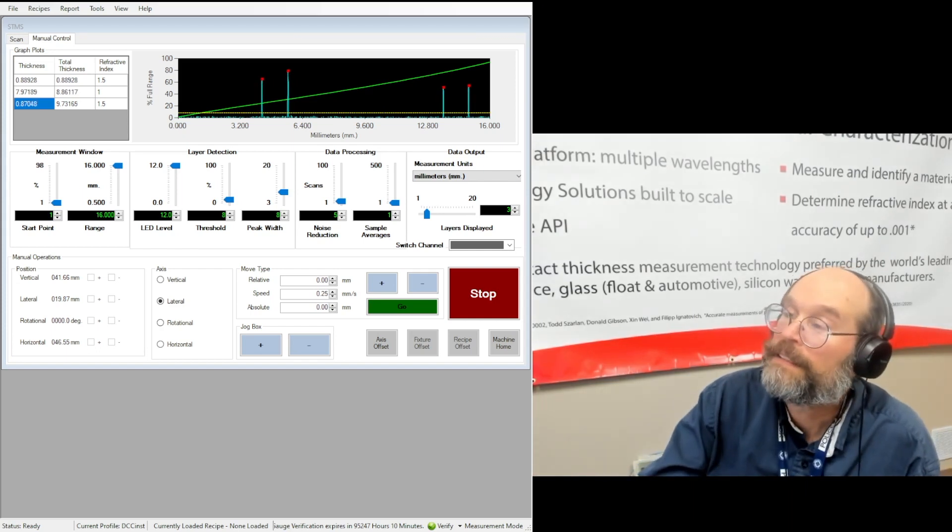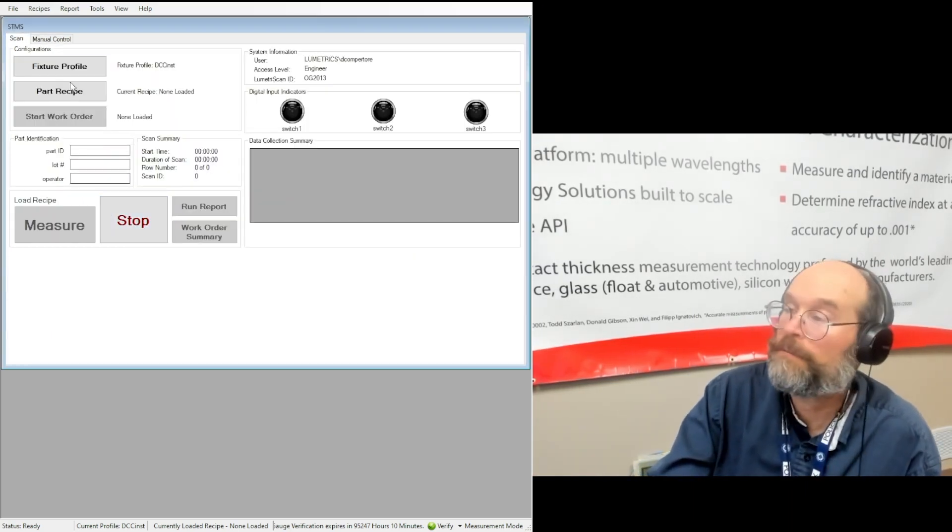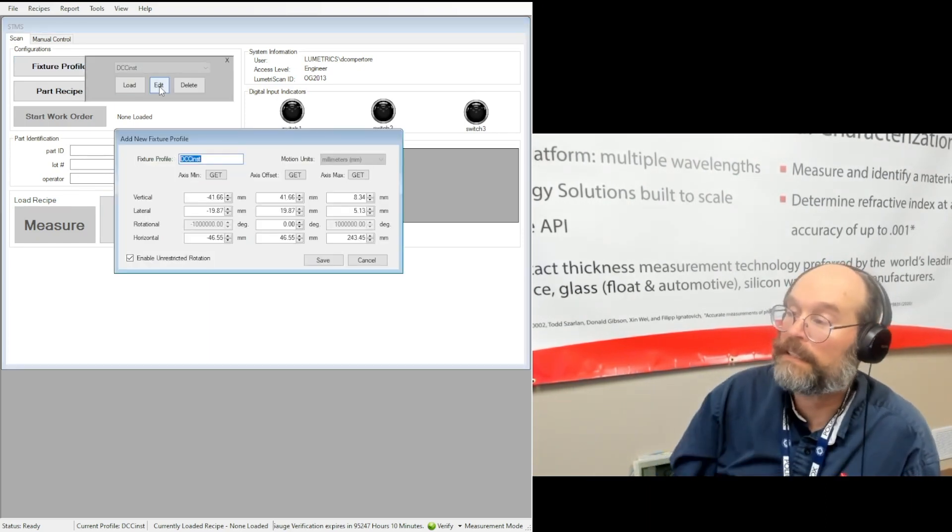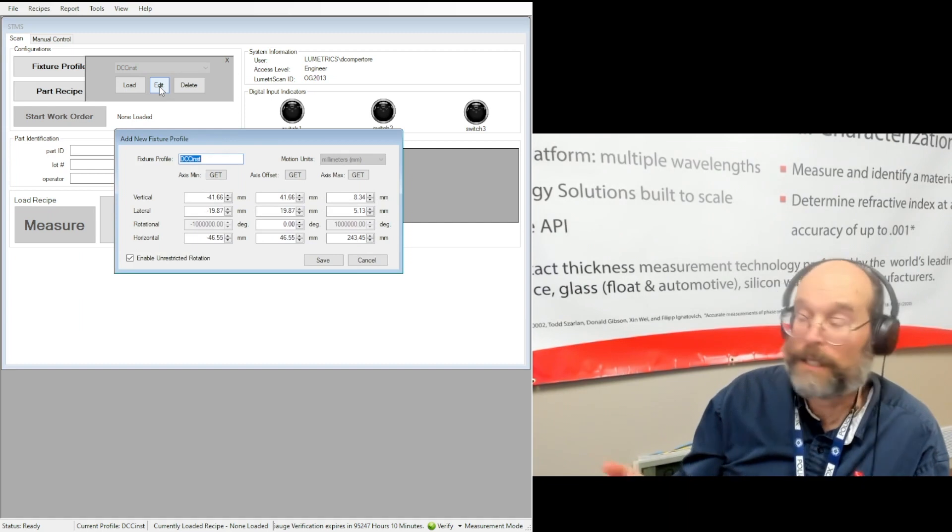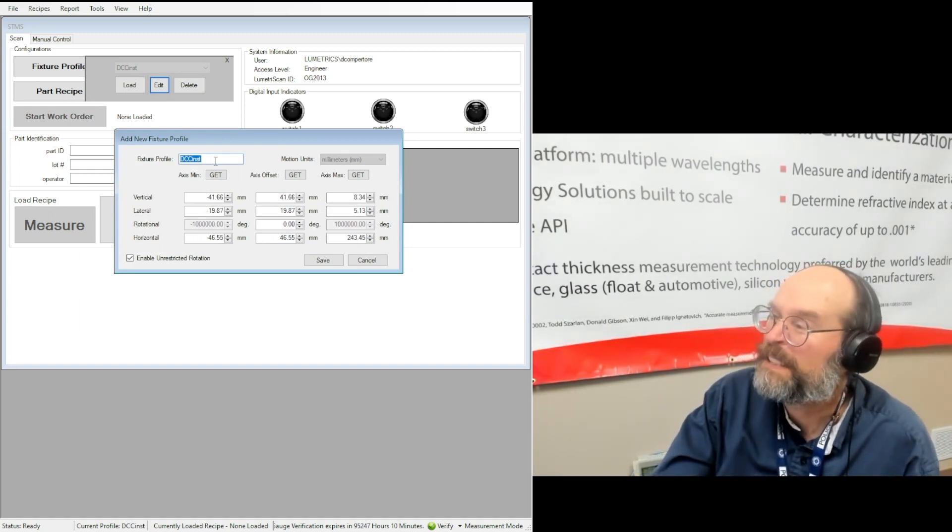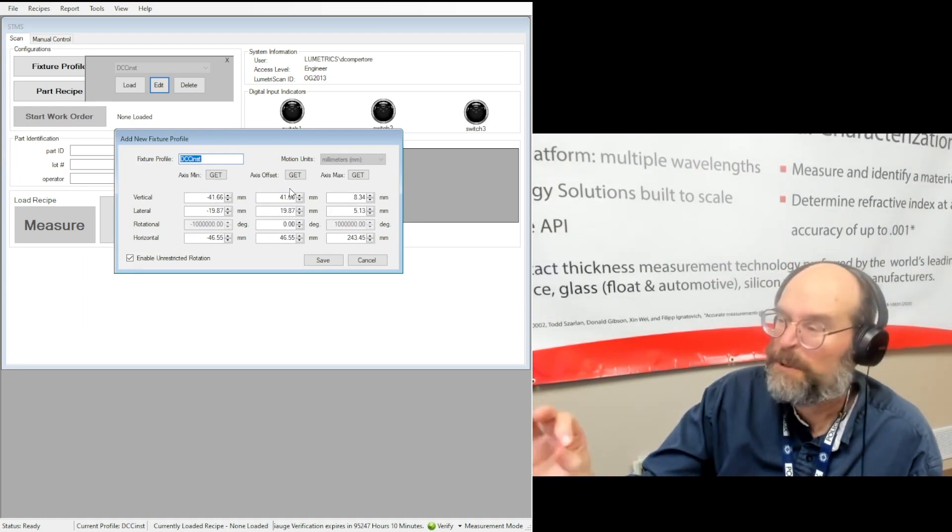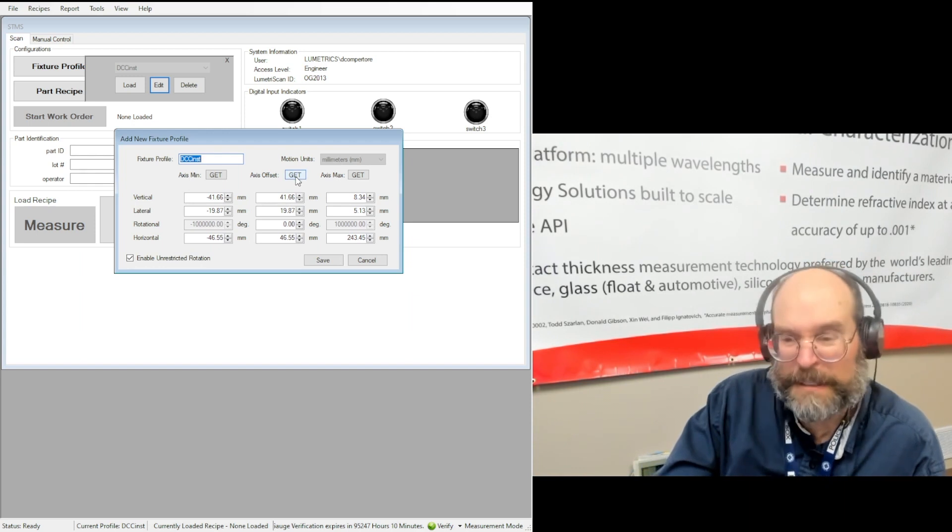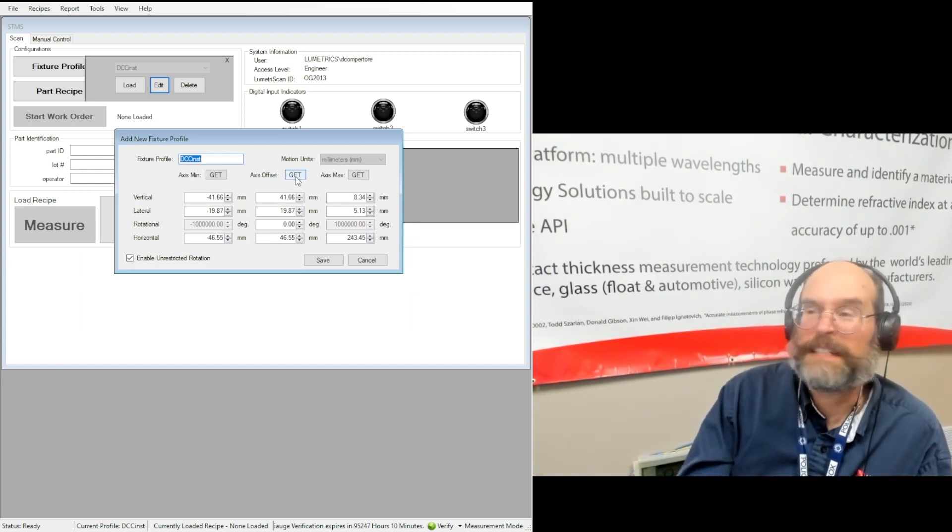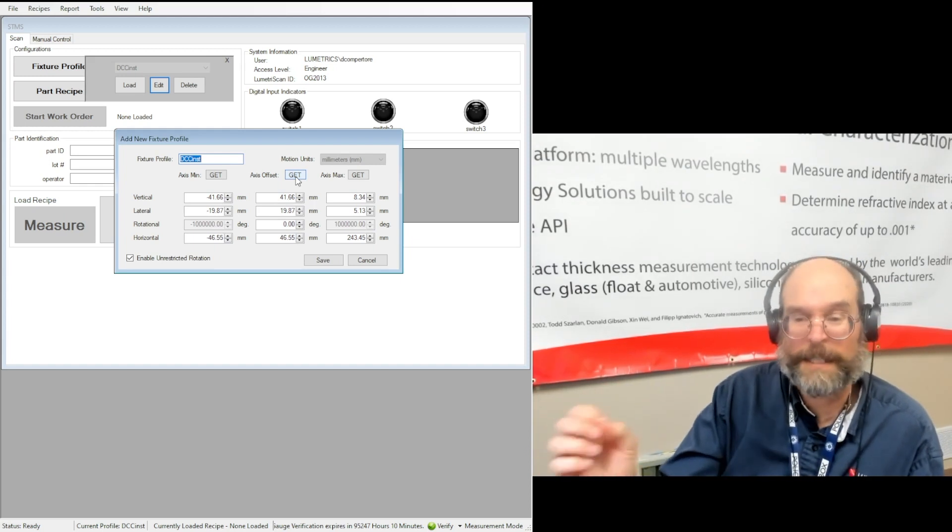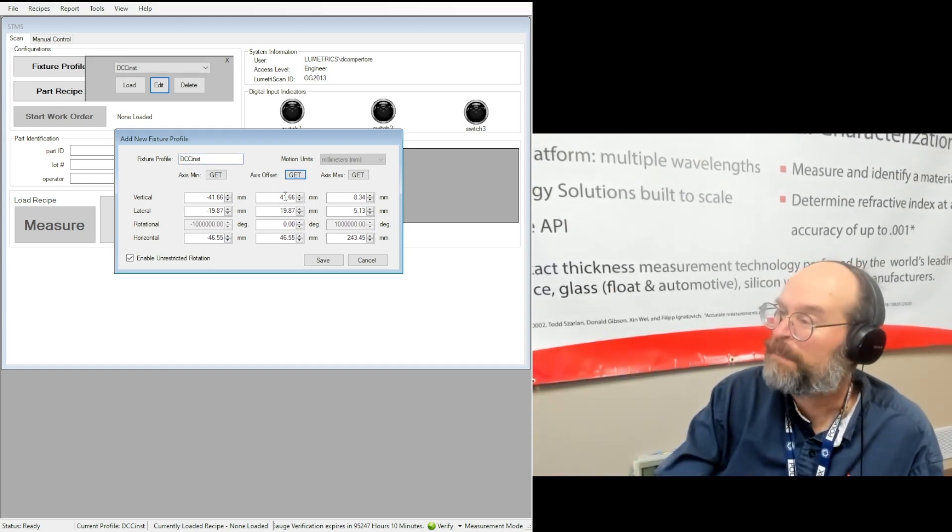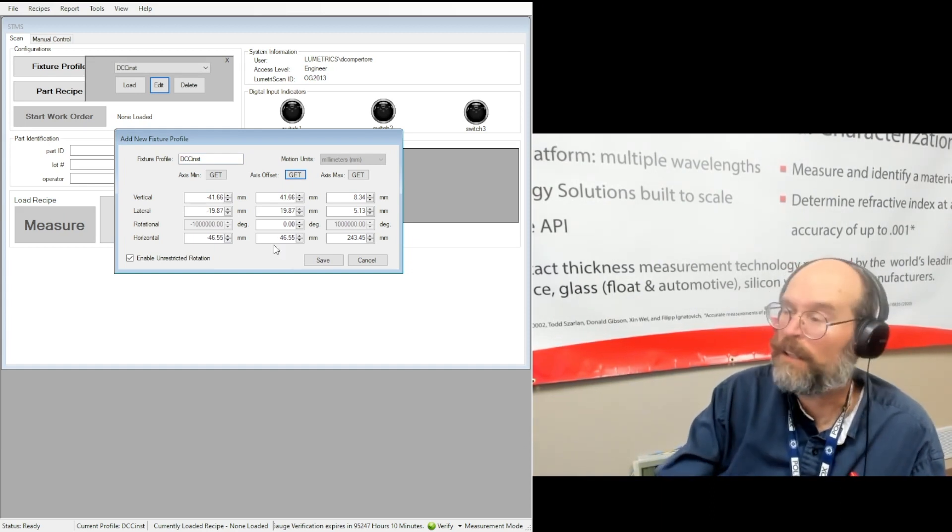Okay, let's go now over to the scan menu where we're going to look at the fixture profile. I'm going to click edit because I've already made this one and I give it the name of DCC INST. The way you use this is you use this middle get button to get the position that you're at where you have the good signal where you want to start your scan. So you click that, it'll populate these four positions, and then you're basically ready to go.